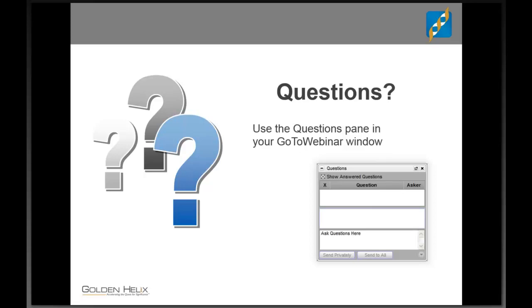Question next, so saving the project as a template basically saves the filter settings and screen tabs. It's a little bit more than that. It also saves all of the selected annotation sources. We didn't dive into that too much, but of course you can choose from dozens of different annotation sources in our data library. It keeps track of which sources you selected. It keeps track of which columns you wanted to have in your active view. And yes, it does save the screen tabs, and it saves all of the filter settings as well. And it essentially allows you to recreate all of your workflow except for the human interpretation aspect, which is never going to be easy.